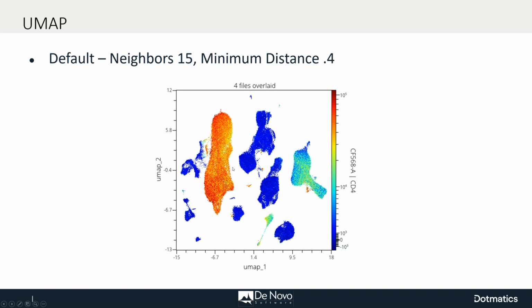So you can see there's this CD4 island. It's well separated from the other islands. It's off by itself. This one is kind of dim. It turns out that this island is the monocytes, and they often have that very dim but still not zero CD4 expression. And these might be maybe the CD4, CD8 dual positives. So there are a few little intermediate populations, but this is where that CD4 population sits with the default settings. The defaults are intended to be a pretty good start.